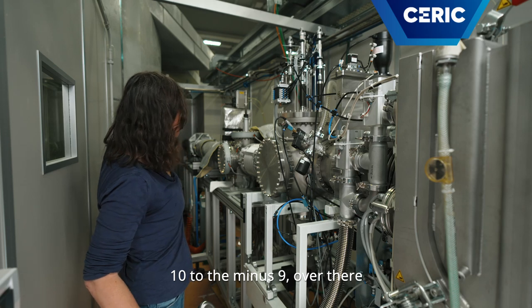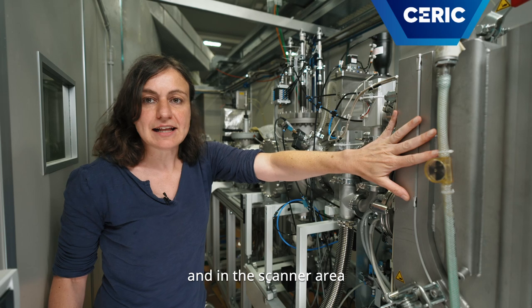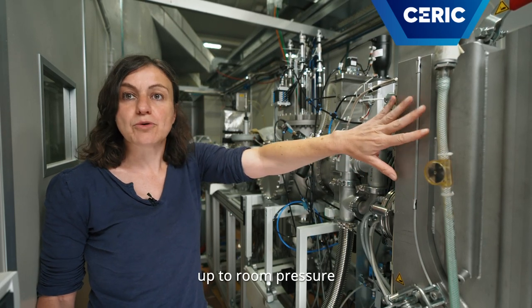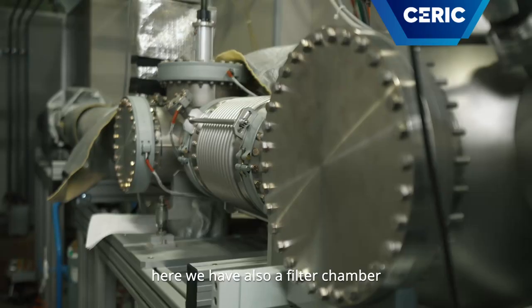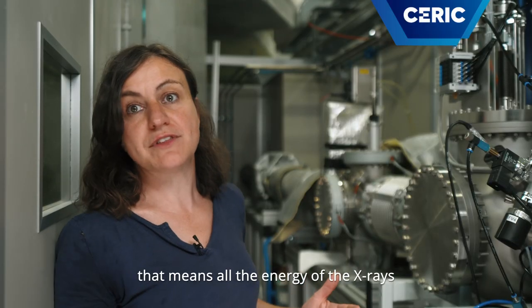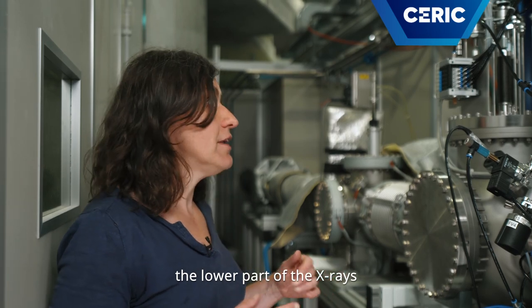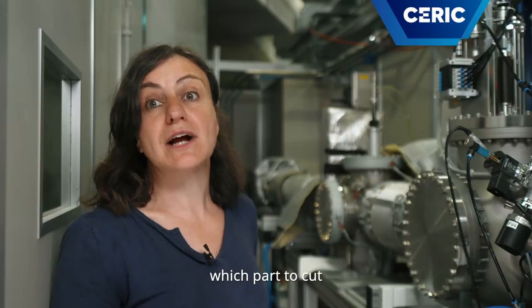We have 10 to the minus 9 over there, 10 to the minus 6 here, and in the scanner area we can go from slight vacuum up to room pressure. Here we have also a filter chamber because we usually use white beam — that means all the energies of the X-rays. And if we want to cut the lower part of the X-rays, we can use some filters and select which part to cut.